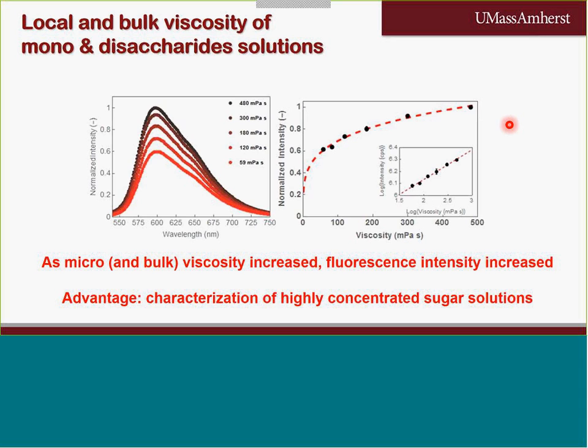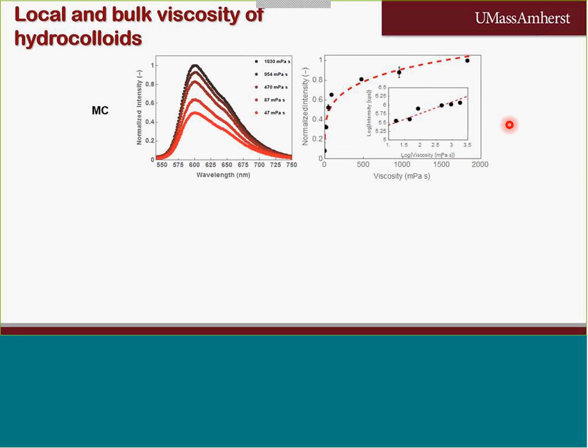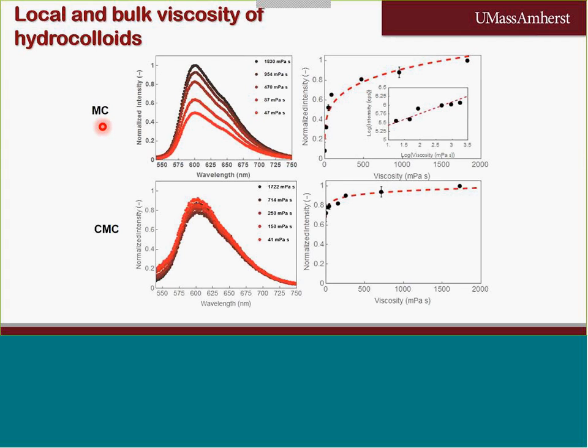To extend it even further, here is what will happen with hydrocolloids. We saw that the sensitivity was still present. However, when we expanded to similar colloids such as carboxymethylcellulose, we could see that that sensitivity completely disappeared.